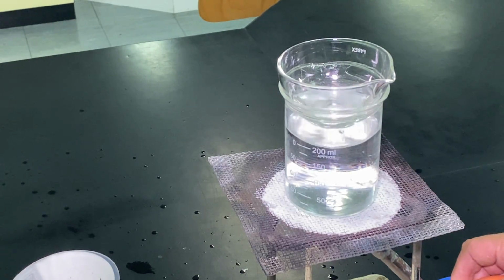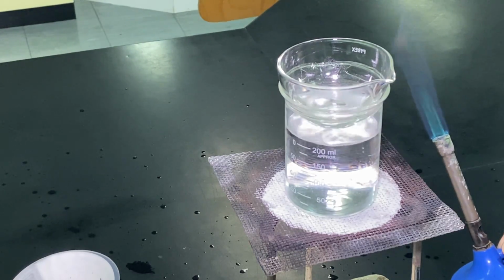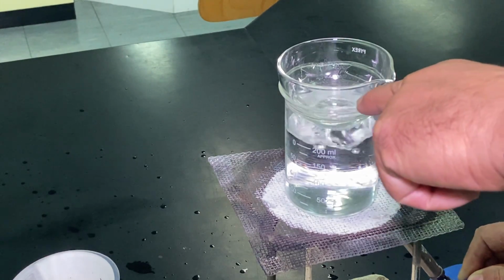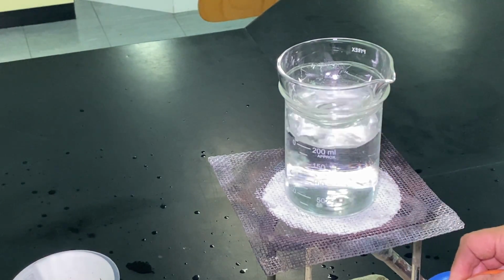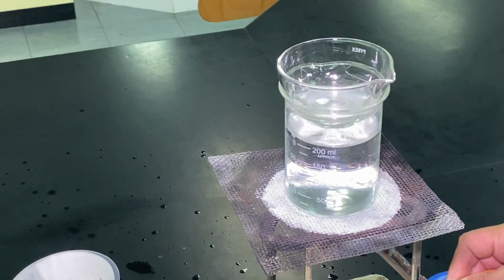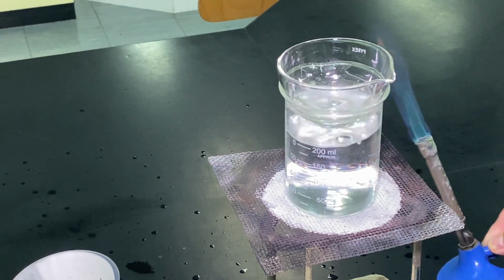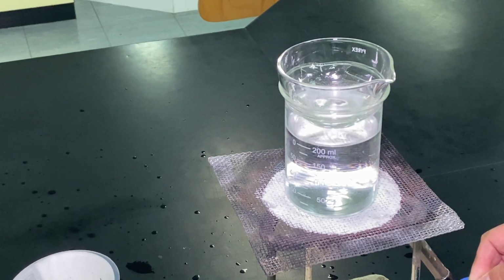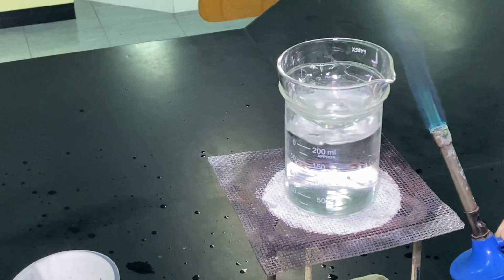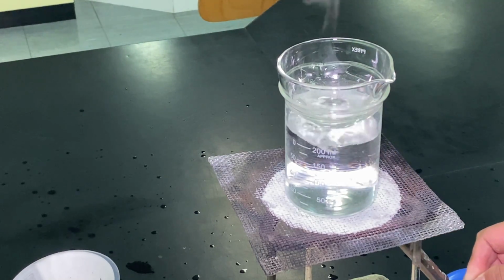the pure sodium chloride crystals left behind in the evaporating dish. So all the water in the solution, that's evaporating into the room. Again, a physical process for separating two components of a mixture, because solutions are not compounds. Whenever you dissolve any soluble salt in water, it is classed as a mixture.